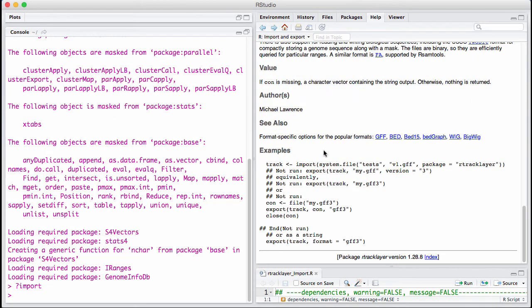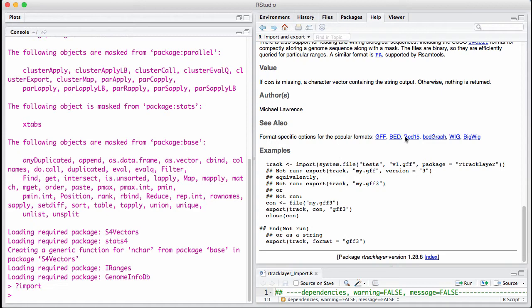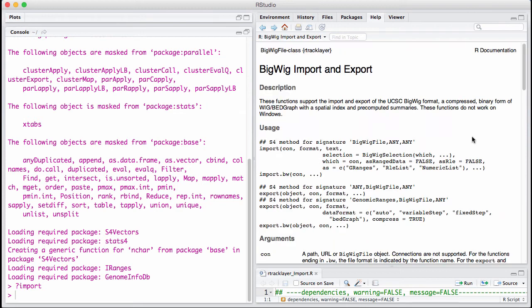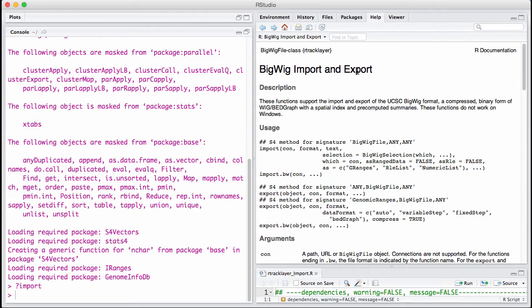What's important to pay attention to is that there's also help pages that are specific to a given format. So if I really want to know all the options for reading in a BigWig file, I click here and read about BigWig import and export. Some of these specific file formats have other options to the import call.